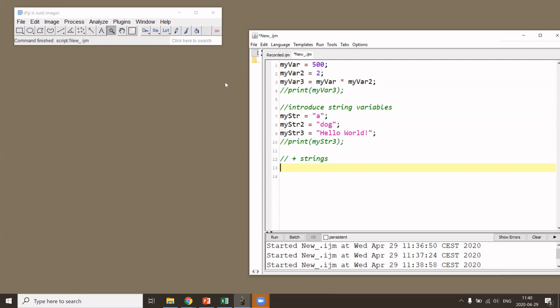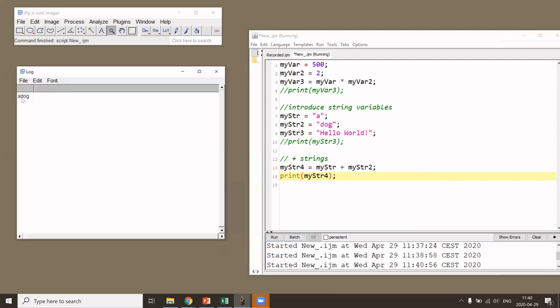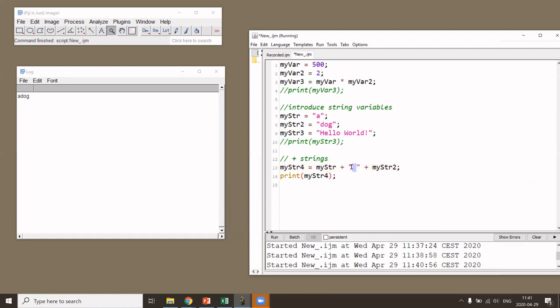When you use the plus sign with strings, the strings are concatenated — glued together — rather than added numerically. For example, 'a' plus 'dark' gives 'adark' with no space. To add a space, you can glue together the first string, plus a string containing only a space, plus the second string. Running this gives 'a dark' with a space between the words.